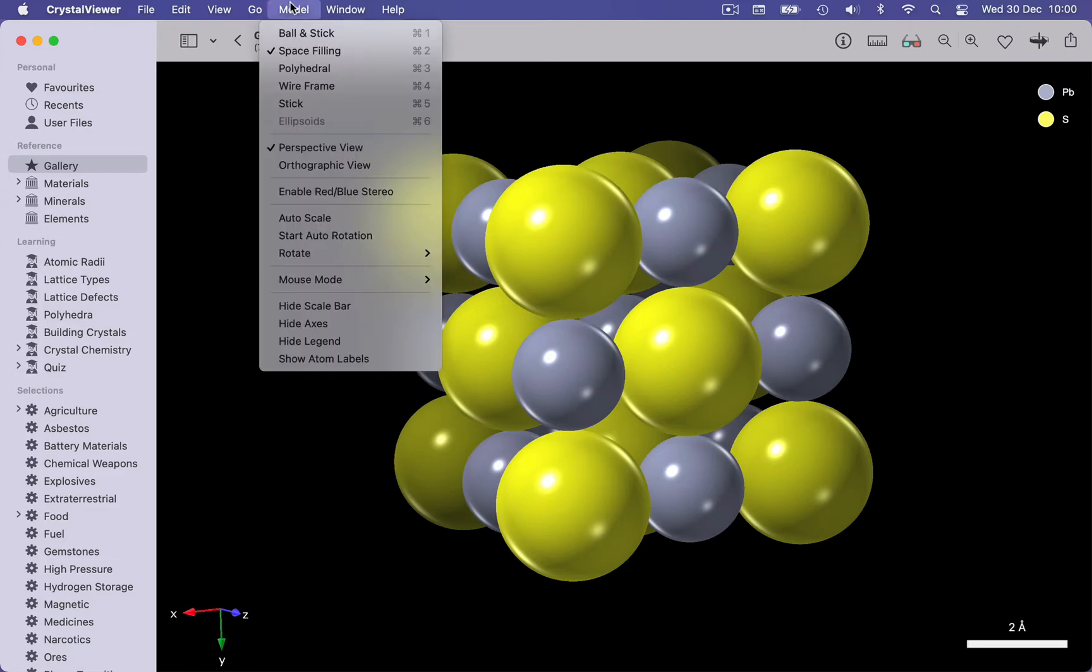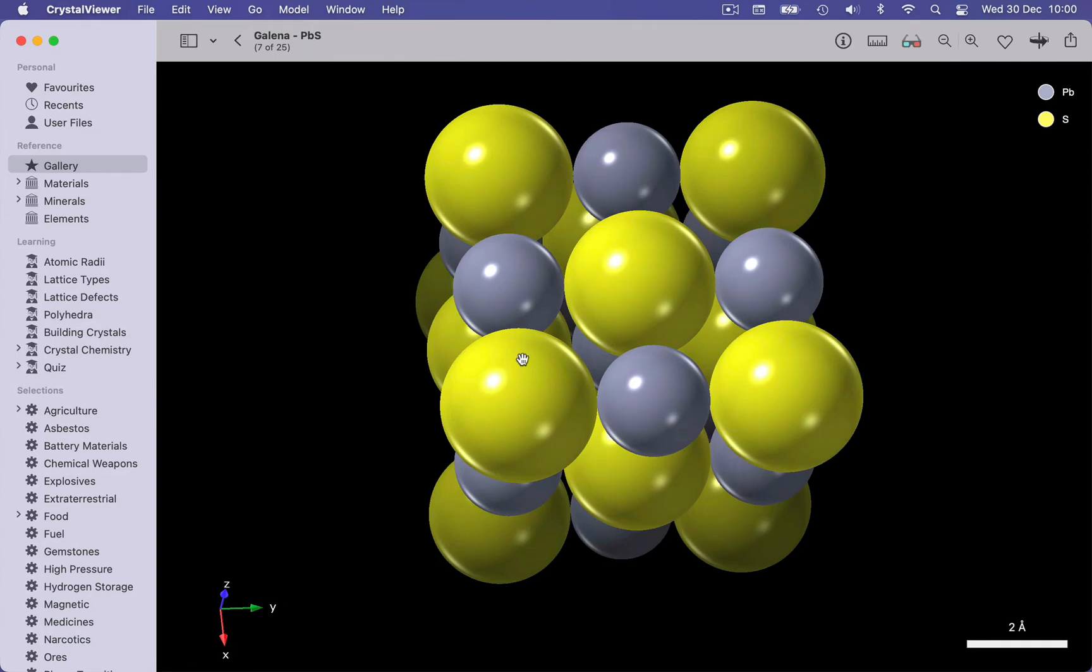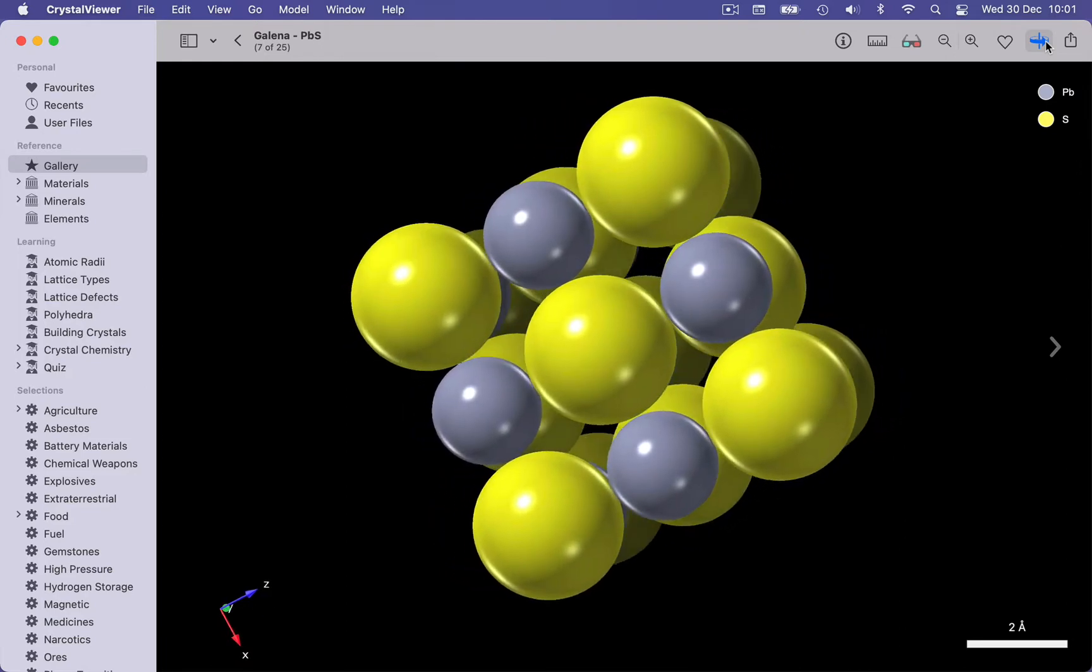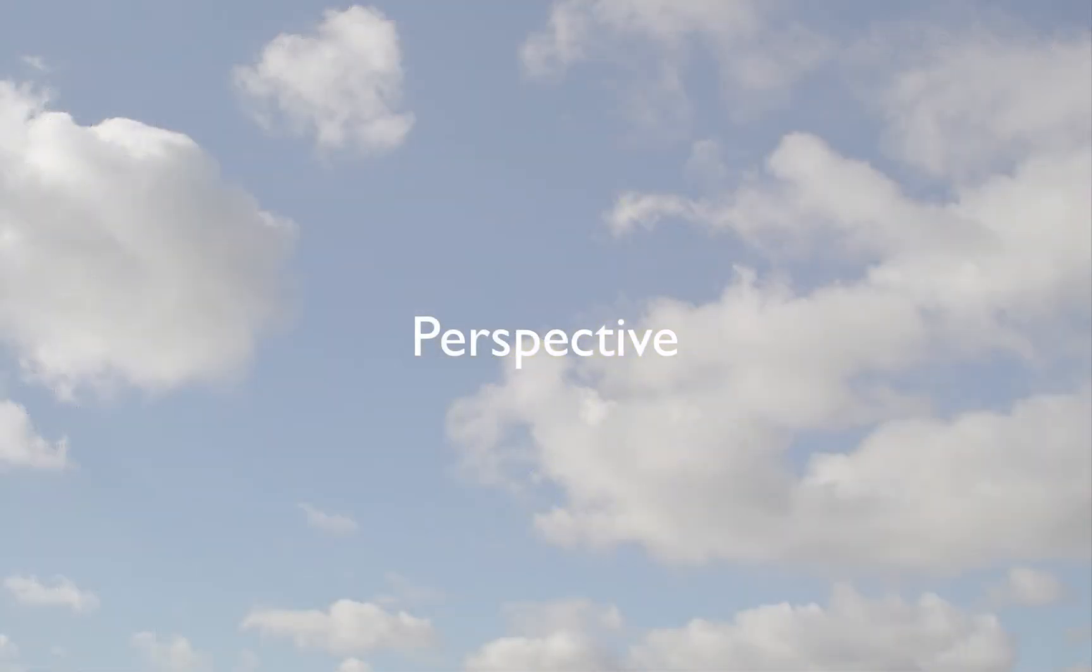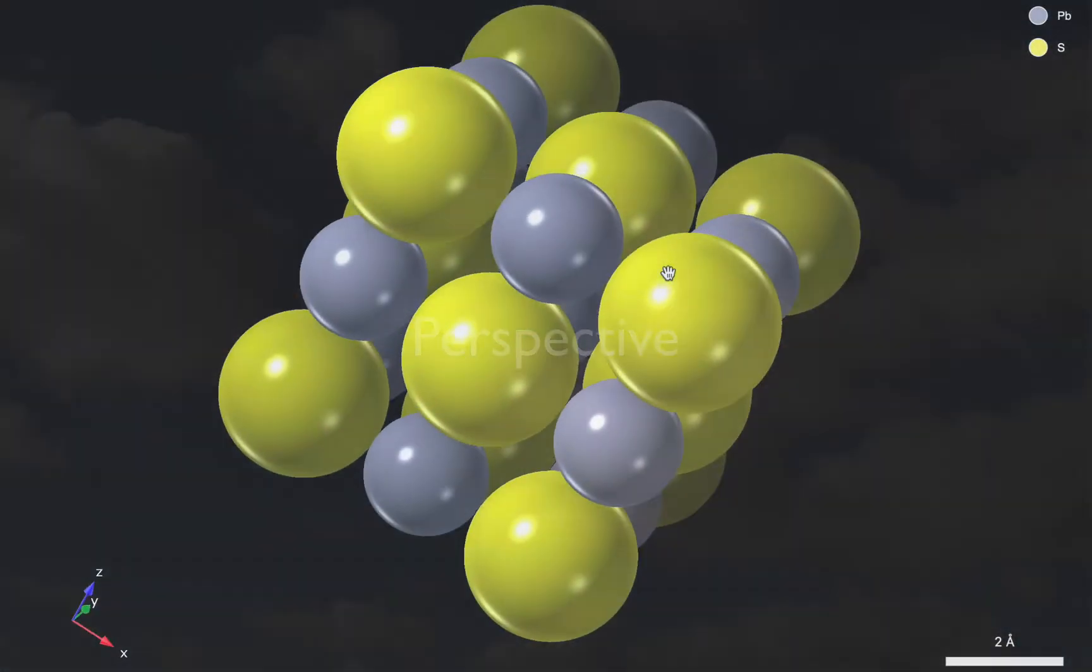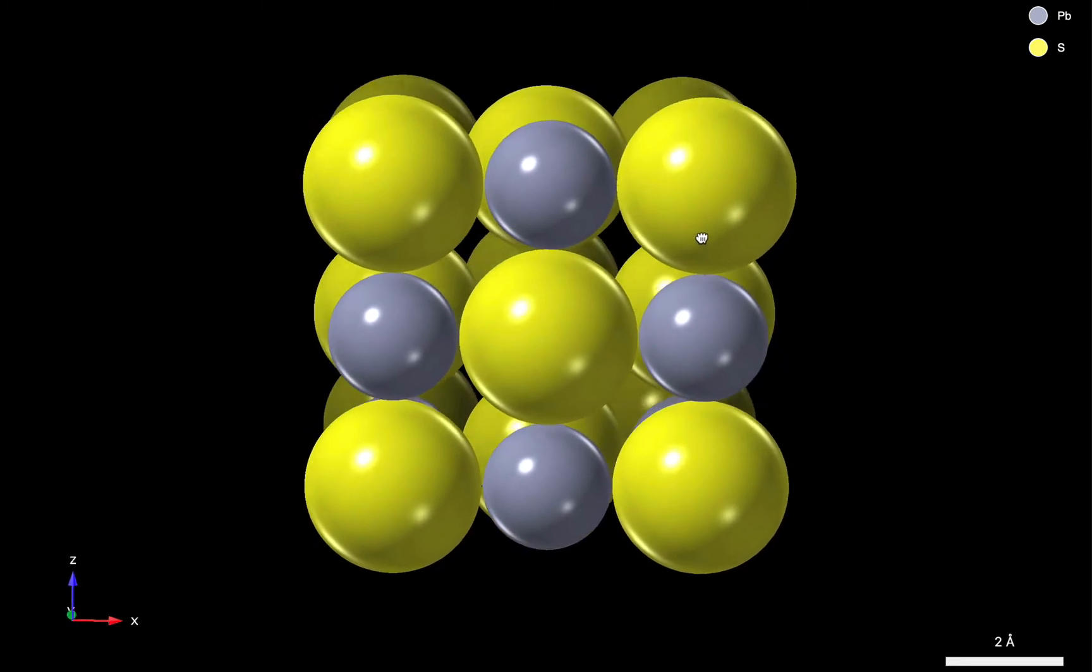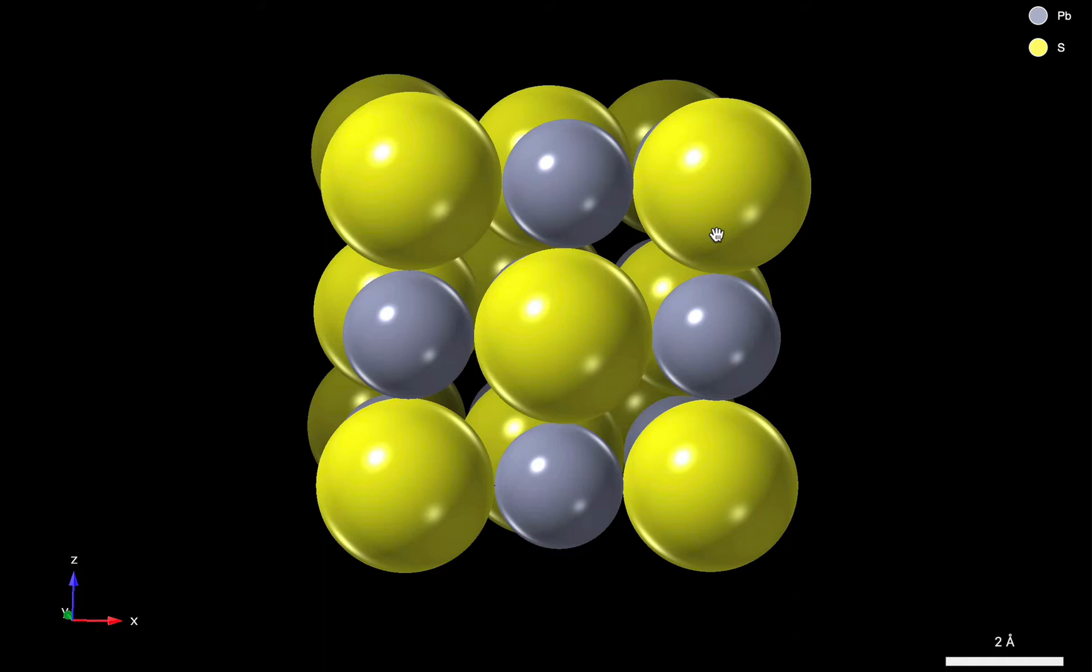We can go to the Model menu to rotate about 90 degrees through any of the screen axes. We also have the option of Auto-Rotation, which we can get to using the Auto-Rotate button in the toolbar. Now you may notice that there's a degree of perspective that's been added to this model. The atoms in front look slightly bigger. By default, Crystal Viewer applies a subtle amount of perspective to any structure that it loads. This helps to enhance the sense of depth.